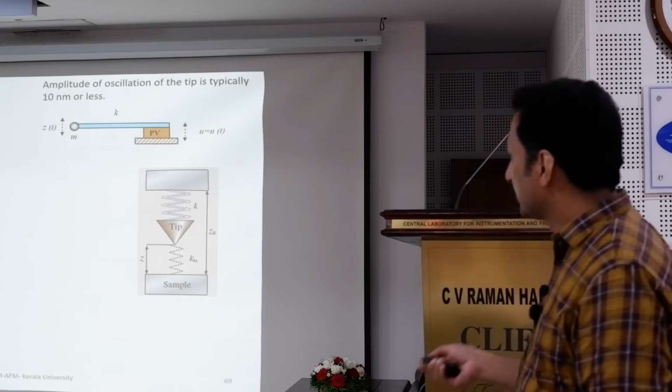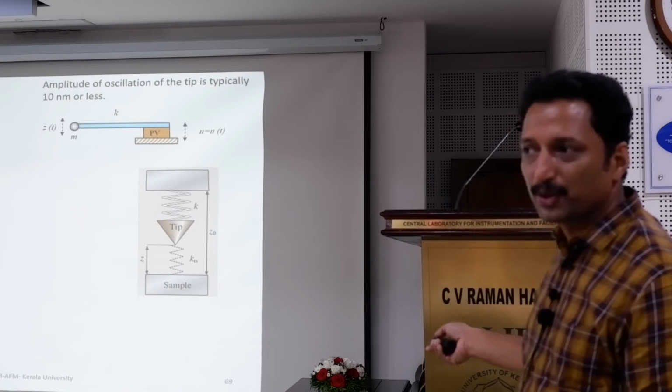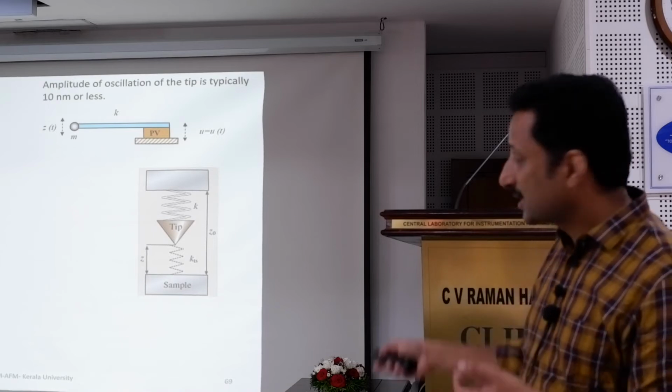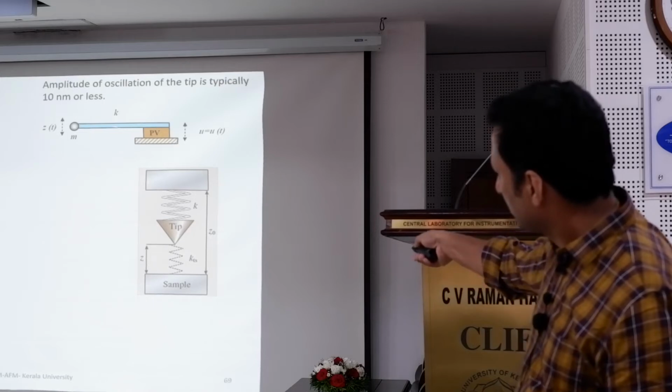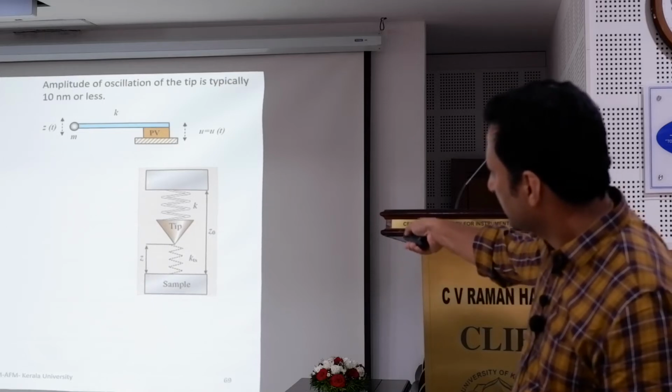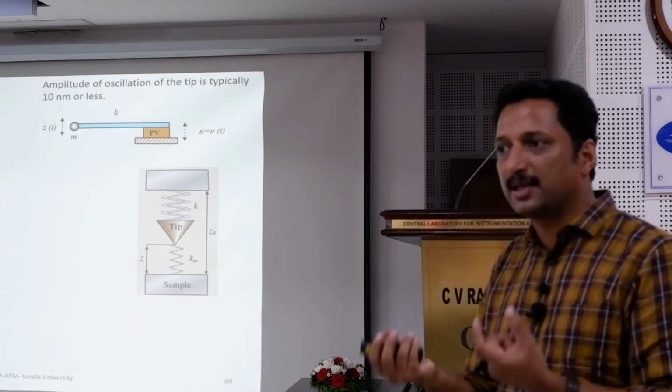Okay, so in those cases we have to modify this equation, because here the viscosity of the liquid will also be added. In that case, the entire tip and the sample, everything will be in that liquid. It's called liquid cell AFM.